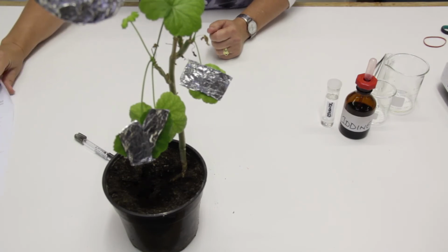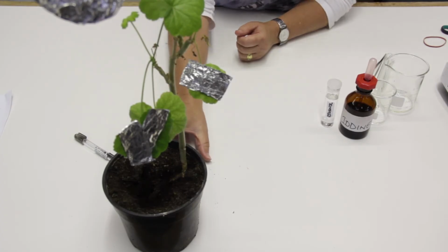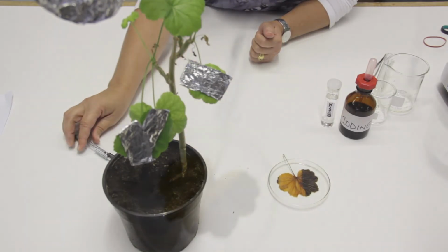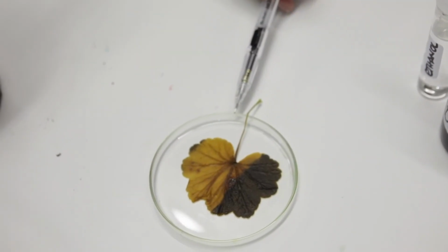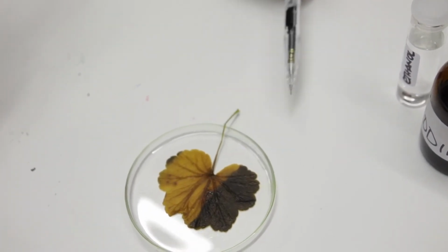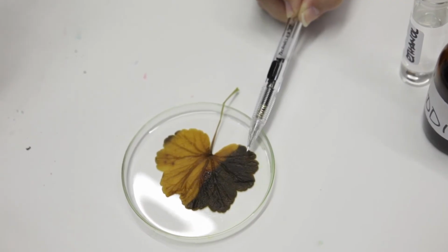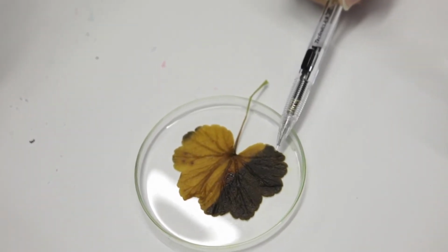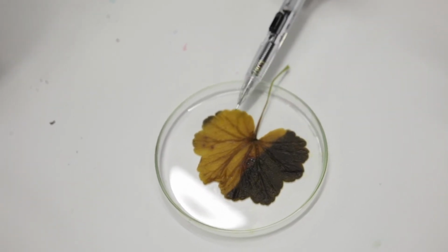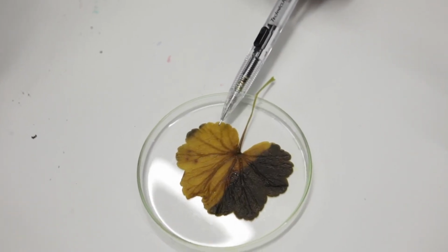When doing this practical, it is important to emphasize what the result of this practical will be. After testing for the presence of starch, we will see the following. The last step in the test of starch is when we place iodine solution onto the pale leaf. On this side, we will see that there was an immediate positive color change. Iodine solution changed to blue-black. But on this side, you can see that iodine solution stayed the brownish color.